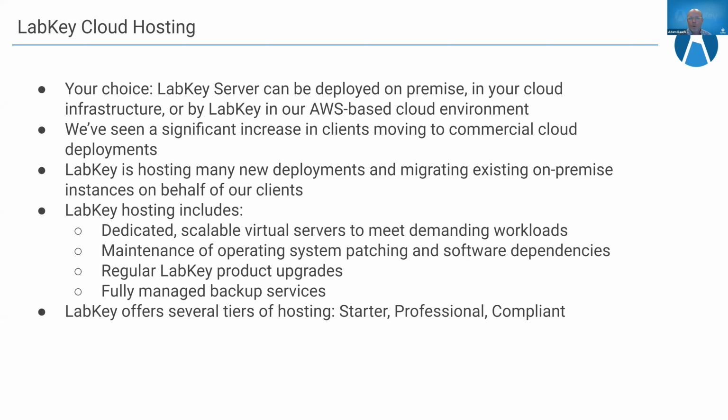When we host, we provide a variety of services, including virtual servers that are scaled to meet your workload. We maintain the operating system patches and the software dependencies. We upgrade LabKey on a regular basis. We manage the backups, we manage the logging and monitoring, all of these services we provide for you, if you wish.